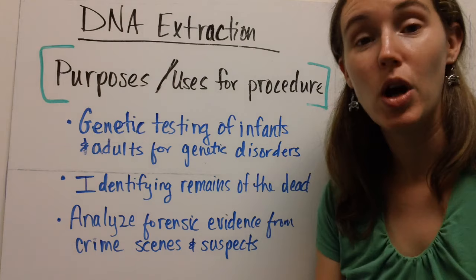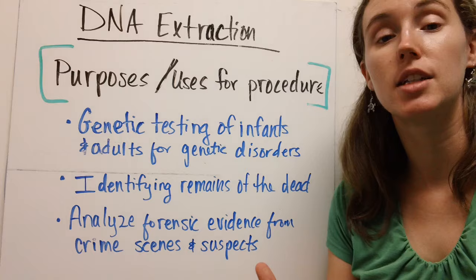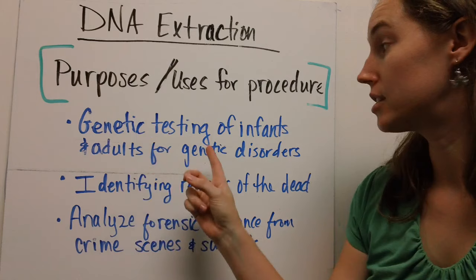In this video, we're going to look at both the purposes and procedures for extracting DNA from living things. For humans, DNA extraction is very important because when we extract DNA from human tissue, we can do several things with it, including genetic testing of infants and adults for potential genetic disorders.